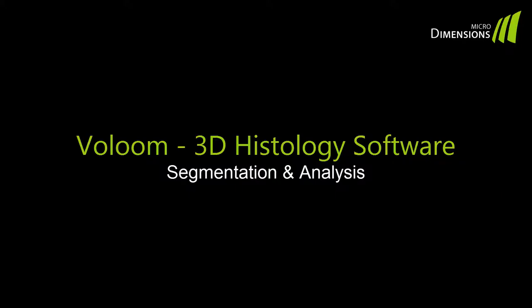Hello and welcome to the MicroDimensions tutorial series for Voloom. This tutorial will show you how to analyze your reconstructed volume using the Segmentation and Analysis tool.